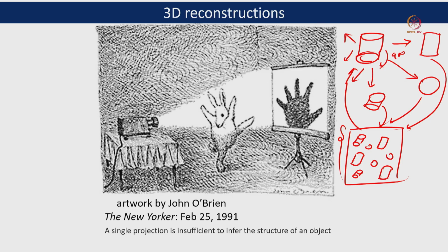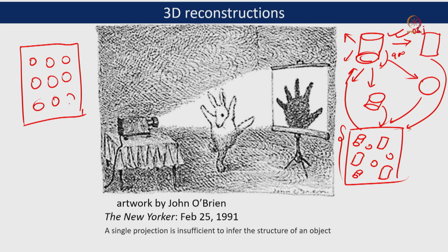But in some cases, with the same object, we are getting only this kind of shape. That means it is a very preferred orientation. Even when we freeze a cryo sample, it has a preferred orientation, and we are getting mostly the top view of this sample.